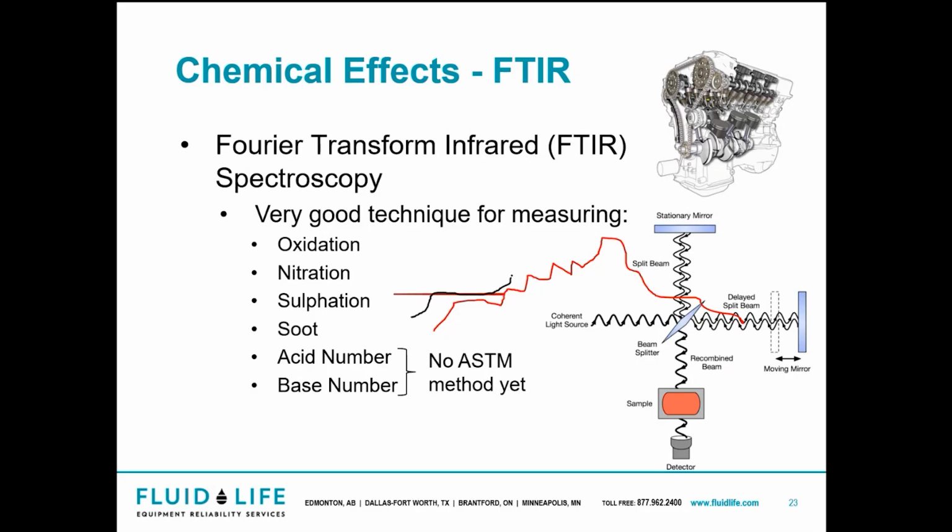Then we measure the difference here. Even there, that line worked perfect. So the difference here, the difference is here. And that's going to give us the value of how much contamination, for example oxidation, is in your grease sample. Again, this test isn't on the grease, it's the oil pulled out of the grease.